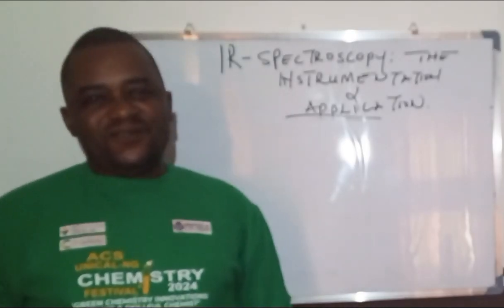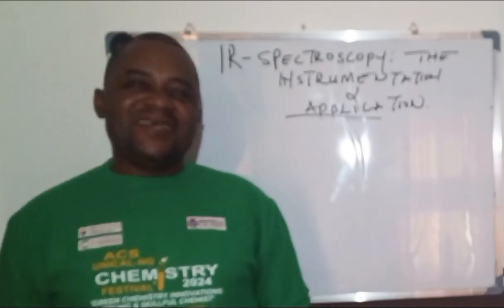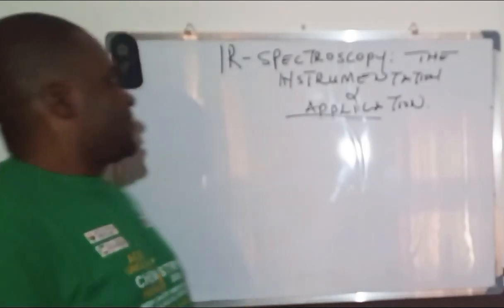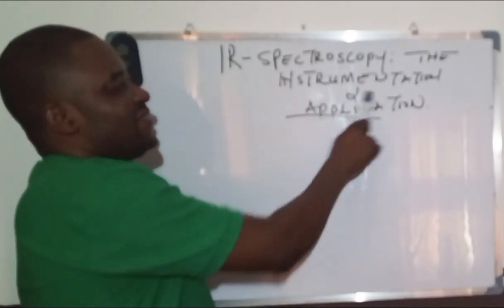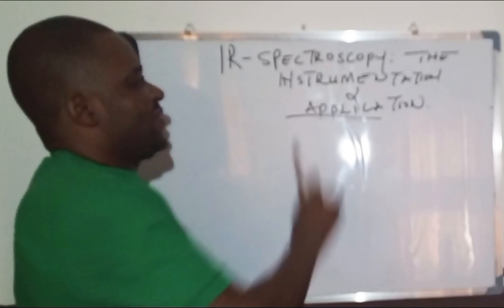Another class. This is Dr. B, your chemistry teacher, and today we are going to be looking at infrared spectroscopy, the instrumentation and application.